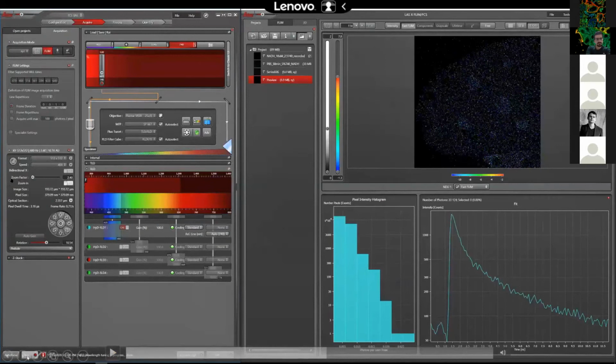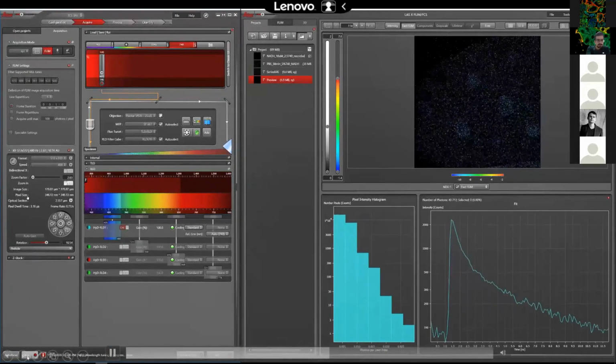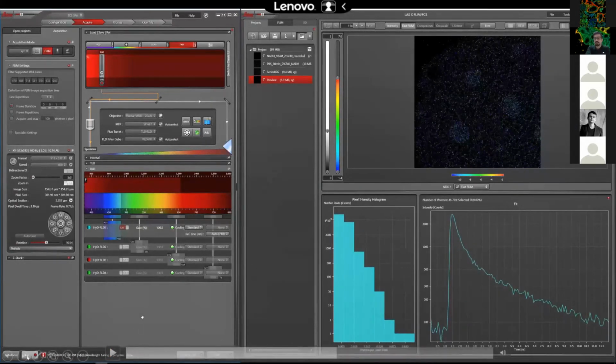here, if you look at the zoom factor, I'm using the zoom factor. So I'm just zooming in the field of view, in the center of the field of view. If I zoom in by the factor of 3, I would get a pixel size of about 300 nanometer. Clearly, it's below the resolution that we can get with the multi-photon system.